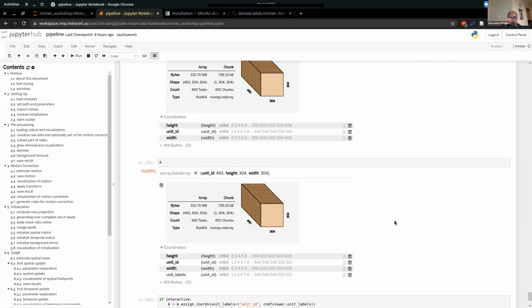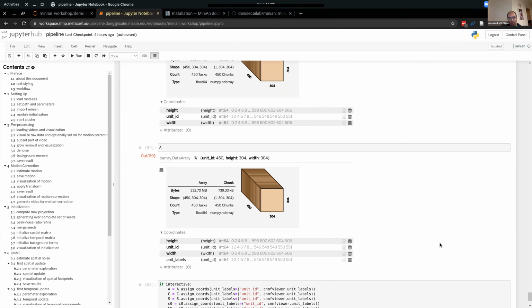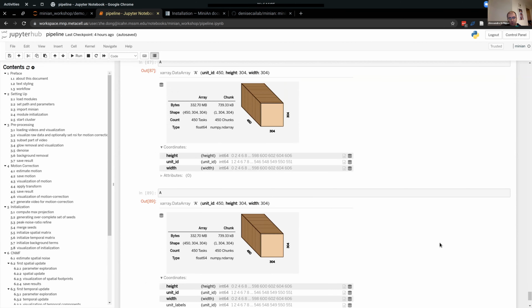It actually used to work well. It stopped working in the last days, probably because I made some update to the packages that I still have to figure out. One thing that I didn't think about before is that I did the batch processing without saving the notebook.